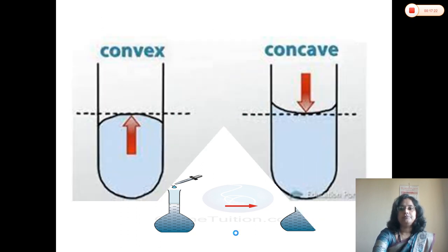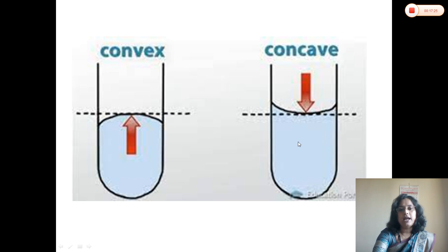into the whole solution. Now see, as I told you, we are preparing two different types of solution. One is a colored solution and another is a colorless solution. When you are preparing a colored solution, it is difficult to observe the lower meniscus. So that's why in such a solution we need to see the upper meniscus. Suppose this is the mark given on a volumetric flask. You have to add the deionized water or solvent up to the limit where the upper meniscus touches this line.